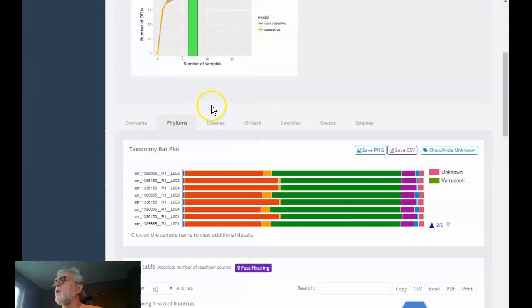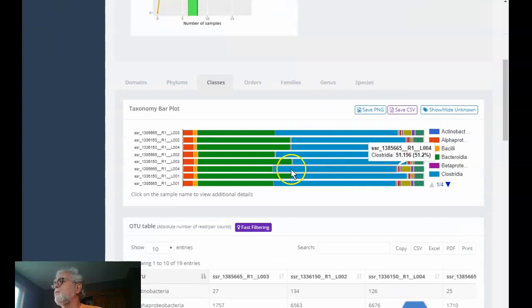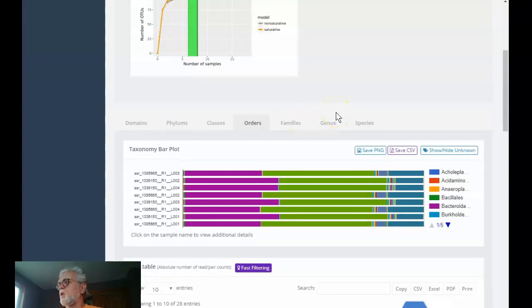And then we can actually go on to look at the classes. We have the class information here. Again, some variation from each pass. One of the realities. We have the ordering, and you notice it tends to be, 4 goes one way and 4 goes another way. And we could go and click on a particular one, and we get more information there.